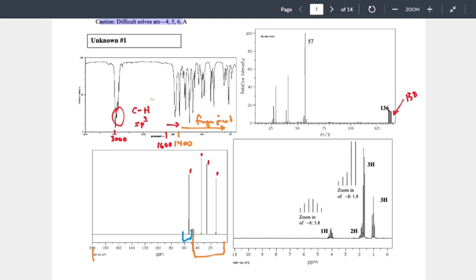When we looked at carbon NMR, there really wasn't a big deal. Okay? So we can look at the carbon NMR, there's 4 peaks, there's 4 signals. I don't see a difference. How many signals are in the HNMR? 4. But there's a hell of a lot more peaks. Why? Because in HNMR, the signal can split. Carbon NMR doesn't deal with that splitting. So what we need to be able to do when we look at HNMR is to be able to distinguish the difference between a signal and a set of peaks, because the signal splits.